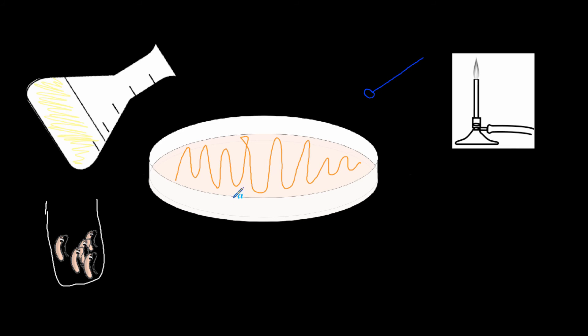Before we do that, the lid is on this agar plate to stop contamination. Then immediately after doing this we replace the lid again and we tape up the agar plate. This is just showing you that we have sealed the agar plate. That stops whatever's in the agar plate getting out and anything from the air getting in. So we tape it up and then we incubate it.